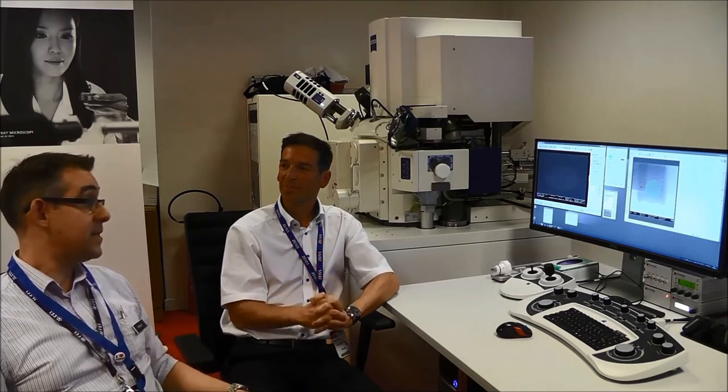That's an important step as 3D tomography and correlative workflows become ever more important. Thank you very much. This is the CrossBeam 540, and if you're interested, check out Zeiss.